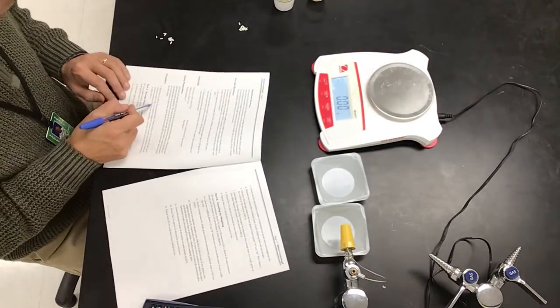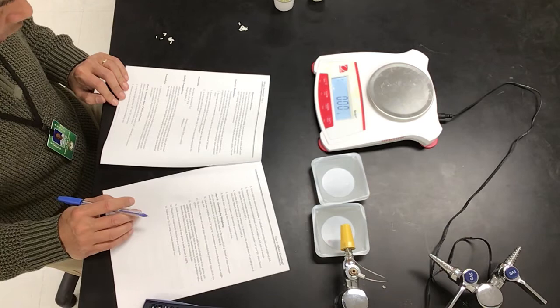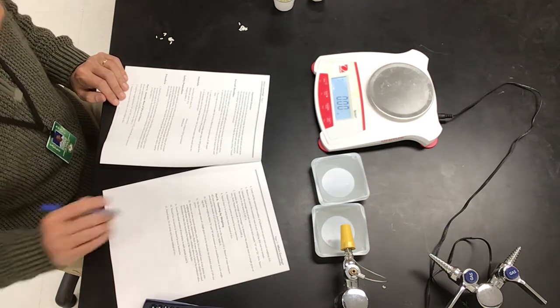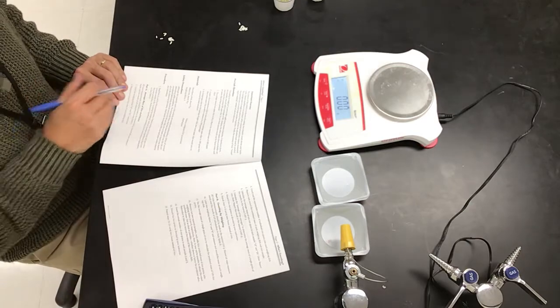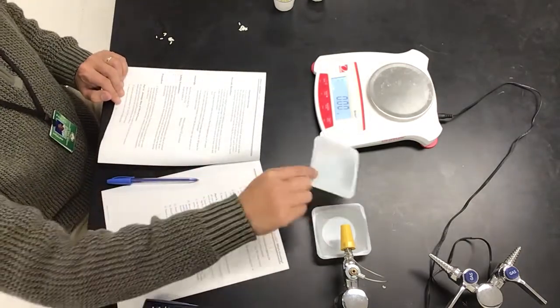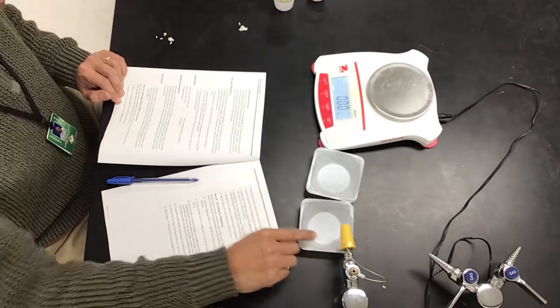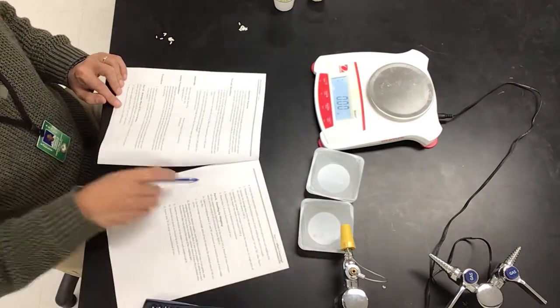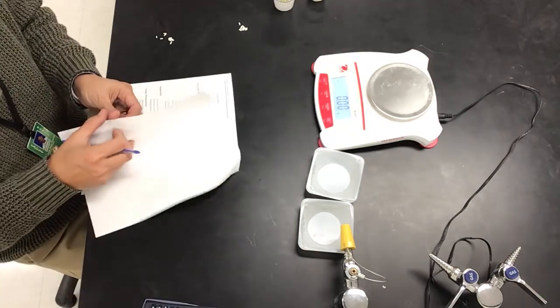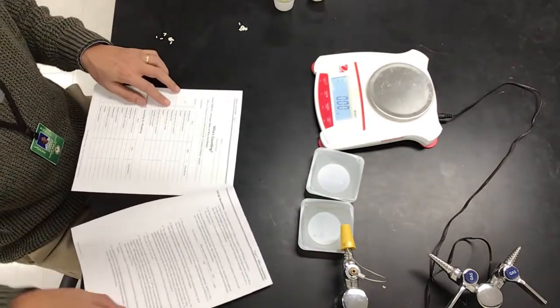So number 1, it asks you to read both part 1 and 2 and come up with a hypothesis to justify your prediction. So come up with a hypothesis, and again, read the procedure. Number 2 says, label the weighing dish 10 and 20, so we've done that already. Measure and record the mass of each dish. To record, the 4th page is where the recording happens, right?